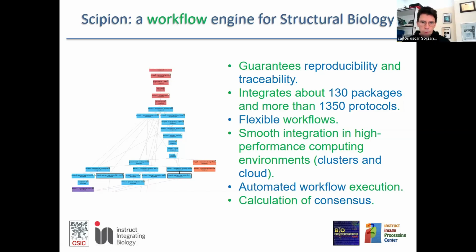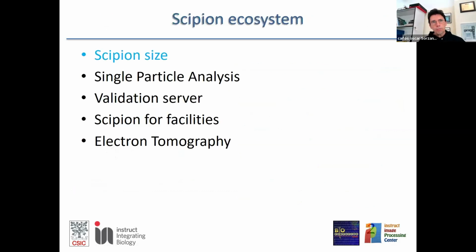And very important for us is what we call consensus algorithms. Some of these boxes compare the output of other algorithms that are supposed to compute the same thing, and this consensus allows you to identify which parts are in common, which are the common output, and which outputs are not so common. So this is the outline of the talk.